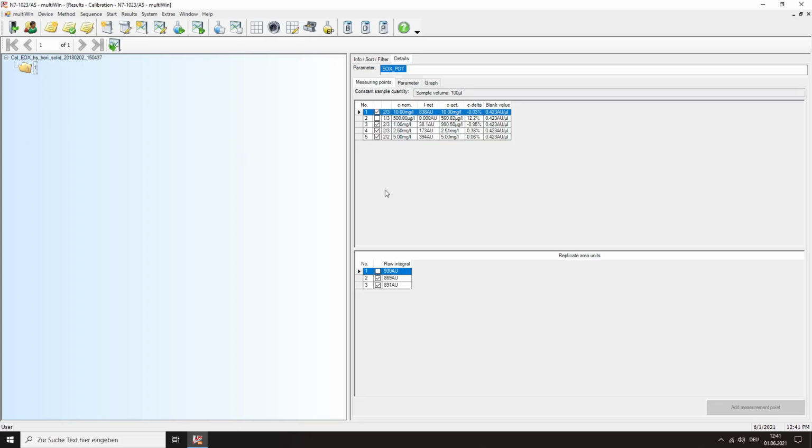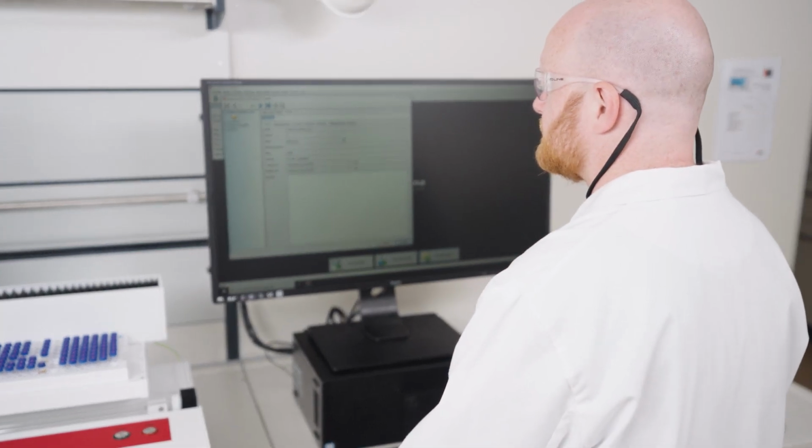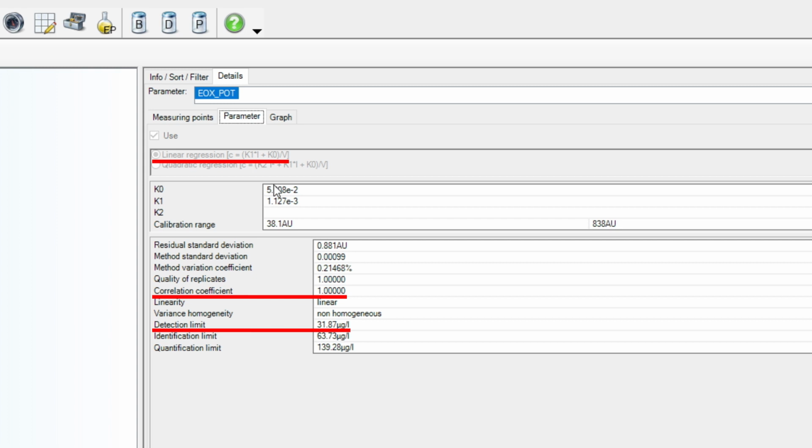Calibrations are normally done with variable concentrations and constant volumes. We need at least 4 different concentrations, 3 replicate injections per each standard. The gained values are processed by linear regression as required by the analytical standards. A good calibration is linear with a correlation coefficient of at least 0.999 and a limit of detection lower than the desired lowest quantity. Once the system is warmed up, the tightness has to be checked before the first analysis.